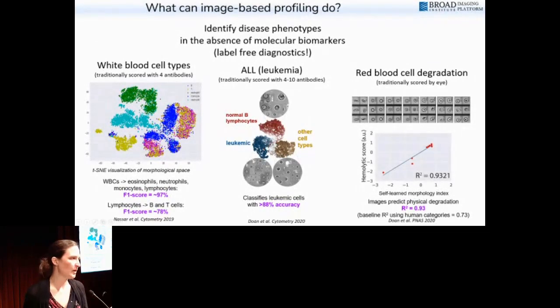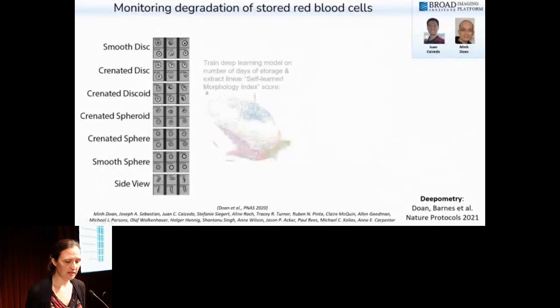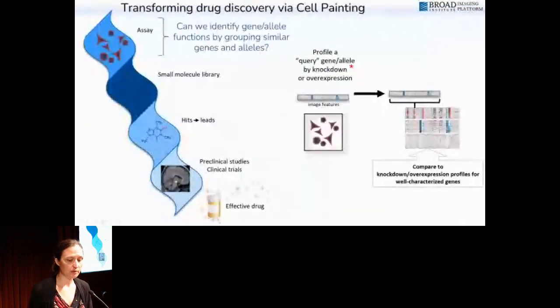So very cheap. You don't have to stain the cells with anything. You're just asking how the cell's material, the absorbance of the cell itself, responds to plain light. In these cases it doesn't matter so much, but it's cool because bright field imaging could potentially be compatible with a really cheap camera that connects to a really cheap microscope that connects to a cell phone camera and has some built-in software that can do some kind of diagnostic in a resource poor area. That's where you would really care about an assay that is using bright field only.